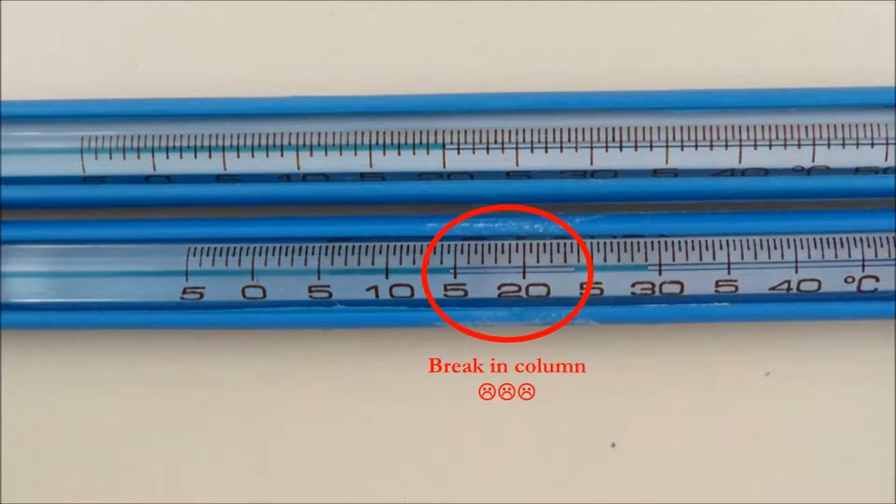Before arriving at the site, make sure there are no separations or breaks in the thermometer's alcohol column. If there is a break, your readings will be inaccurate.